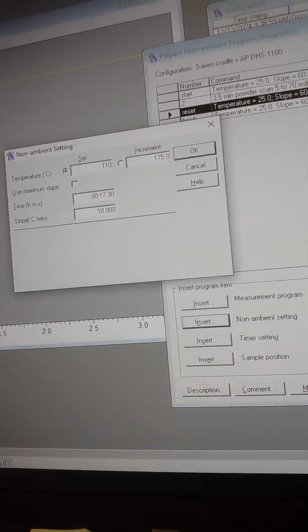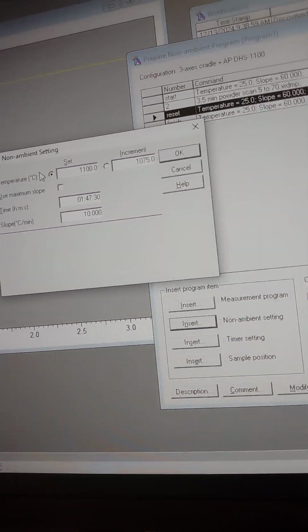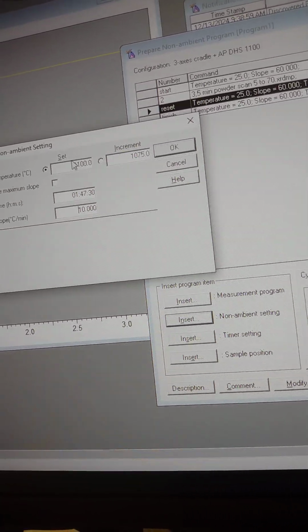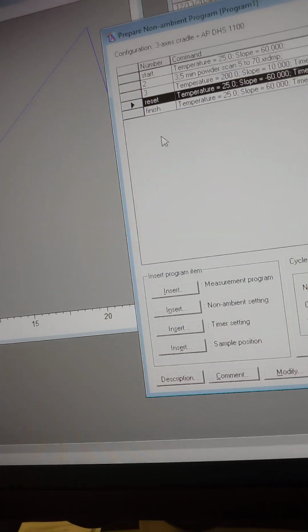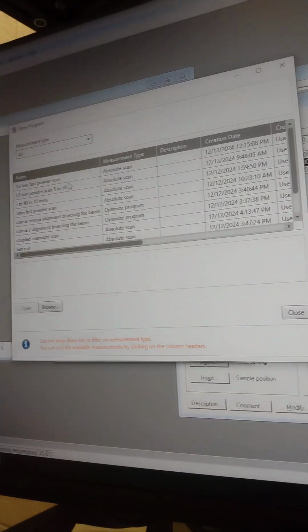With a lot of furnaces, the rule of thumb is to only go 75% of what they say they can do. Yeah, no, this one will actually. Gotcha. Like if we went in and hacked it, we could. So the engineers were smart enough to not confuse people. Yes. Like those stupid MTI furnaces we had in 23, right? Boron nitride heater. Yeah. Okay.